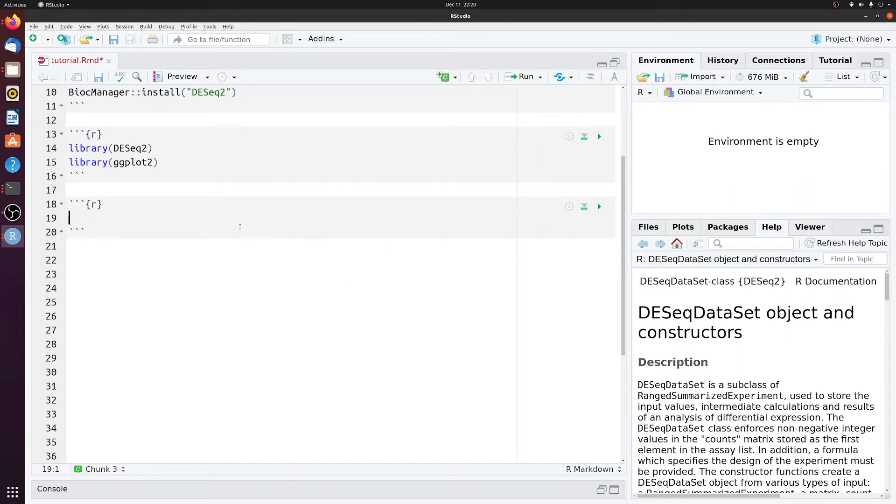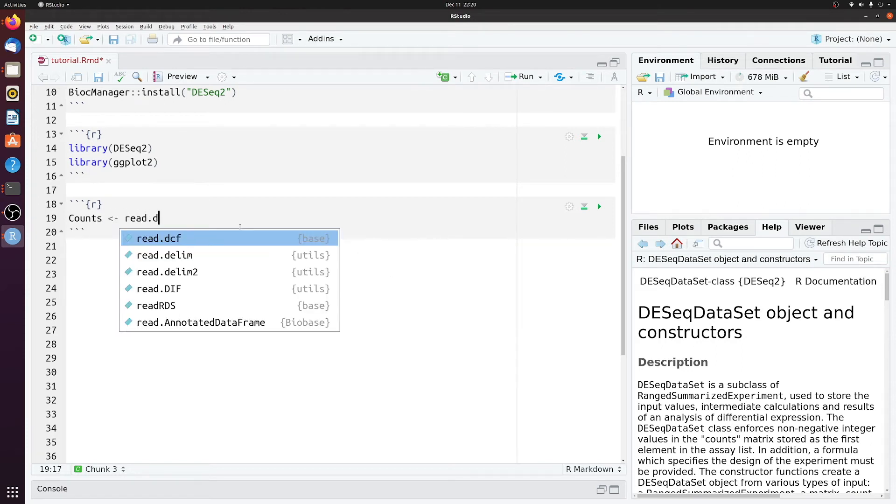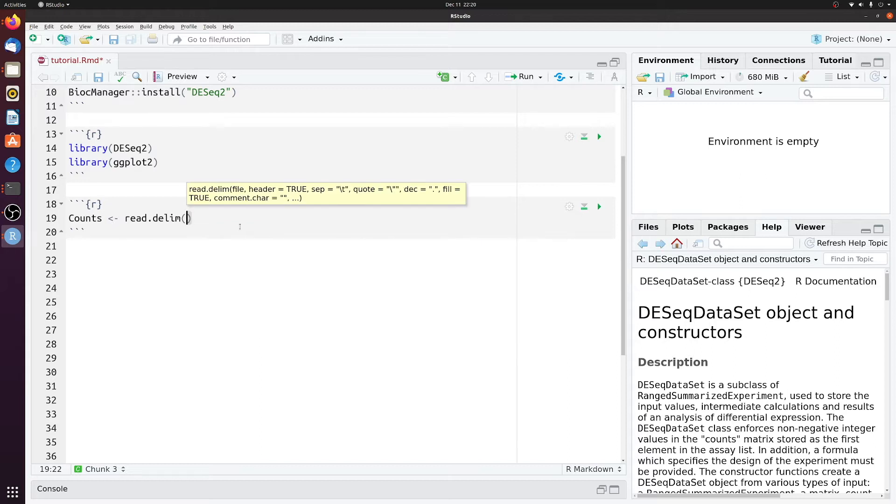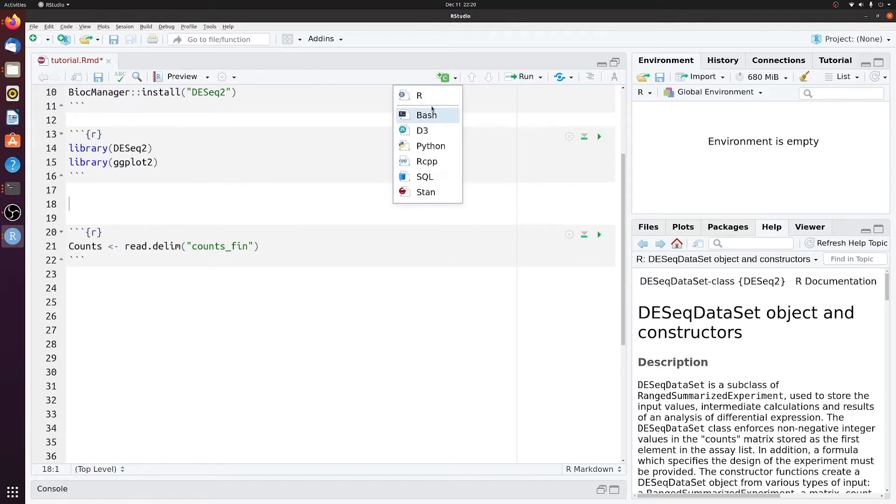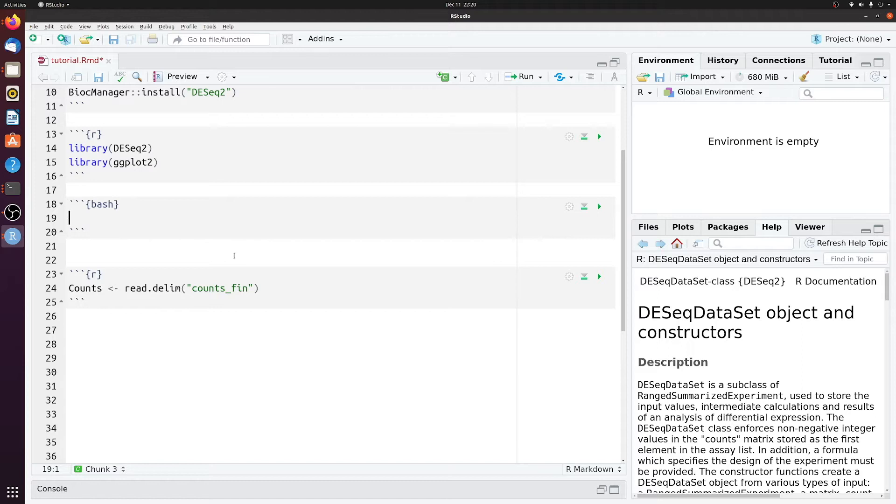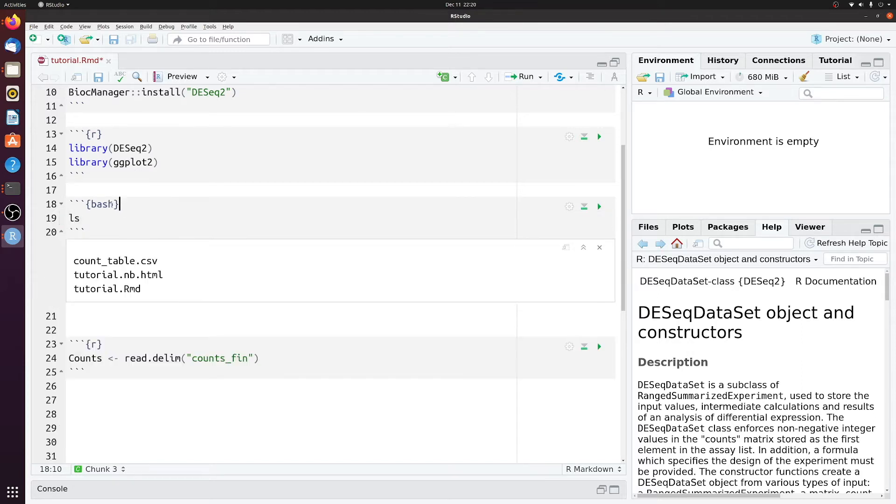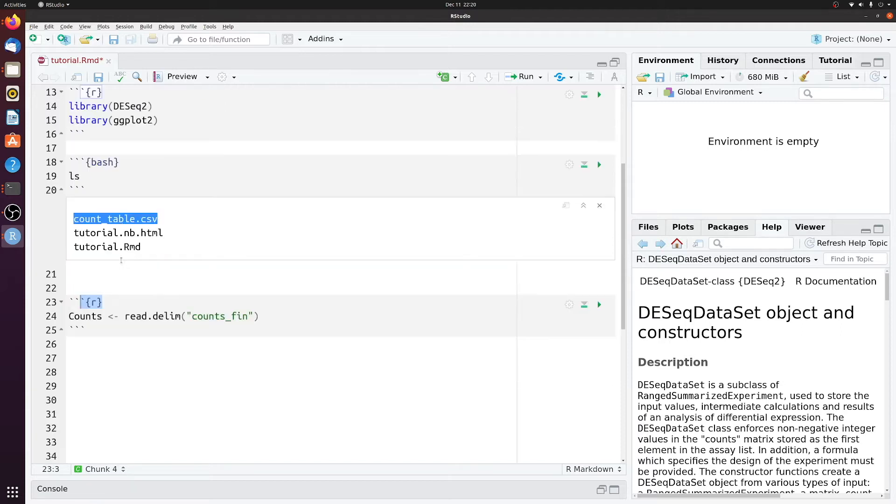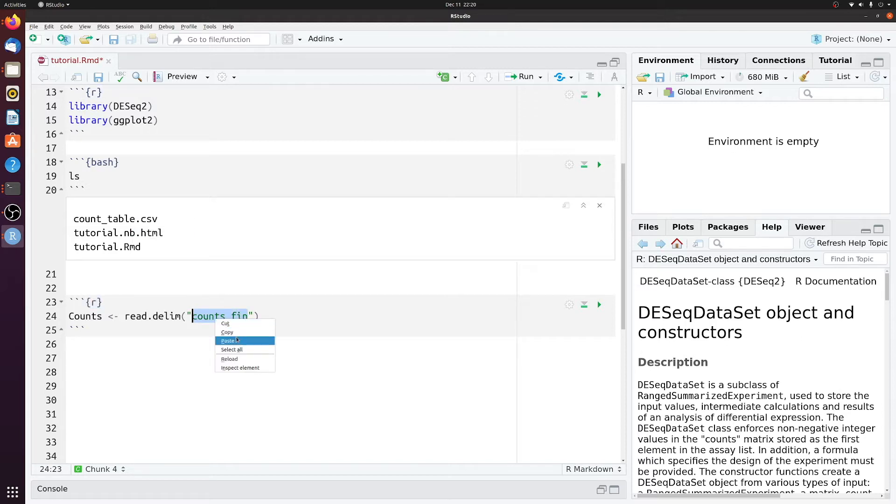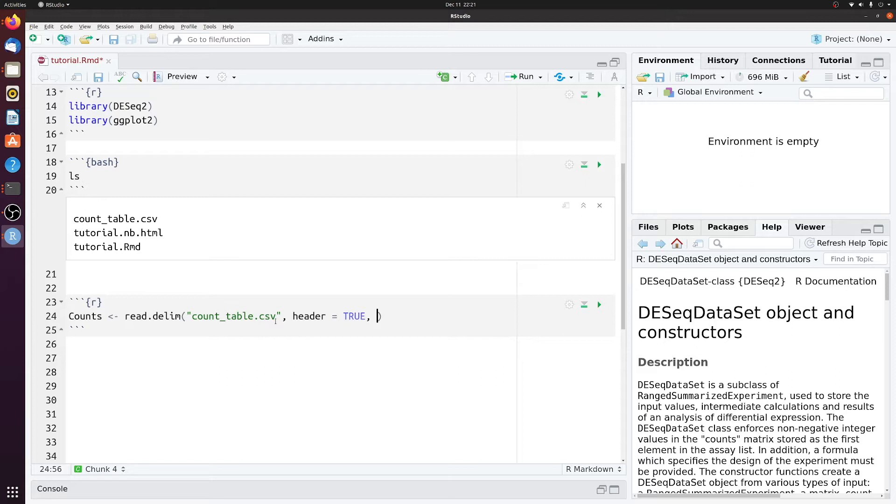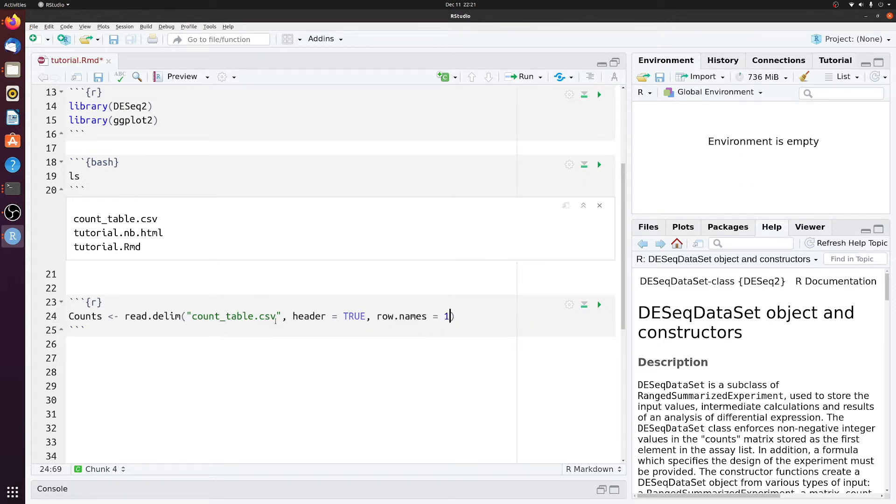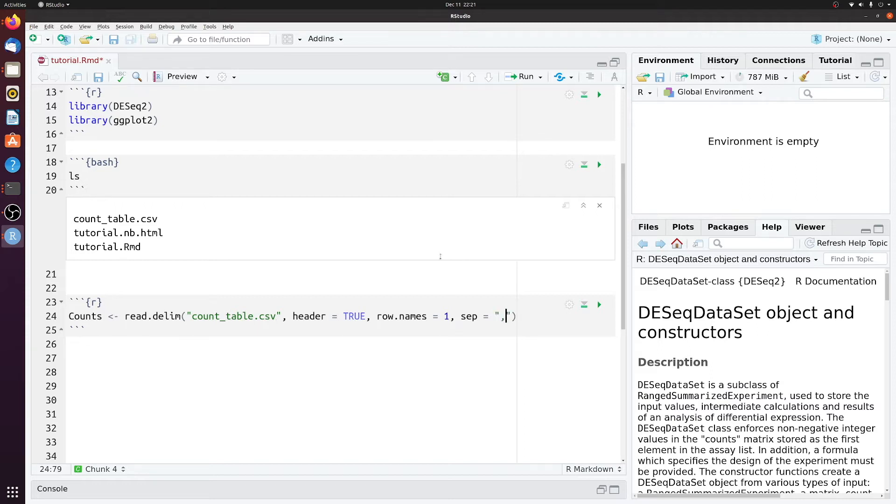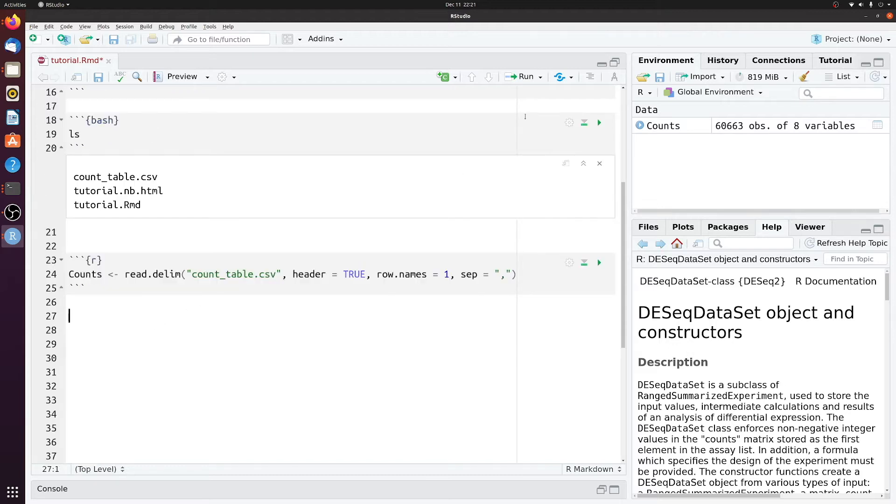We'll add another line. And then we need to load in the counts table. So we'll make a new variable called counts. And this will be a read delim of our counts table file. You can insert a bash line here instead of an R line. And then we can just look at the name here. So we'll just copy this and put it in here. Header equals true. Because we do have a header. And then the row name is not the number one row. And then the separator, since it's a CSV, is a comma.